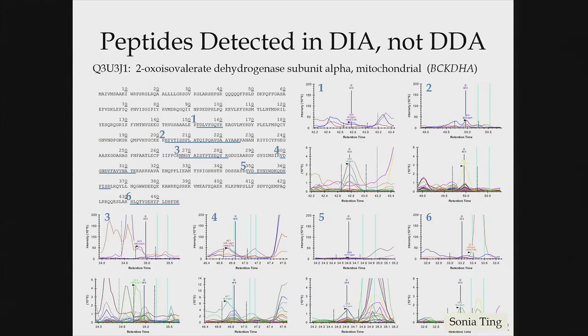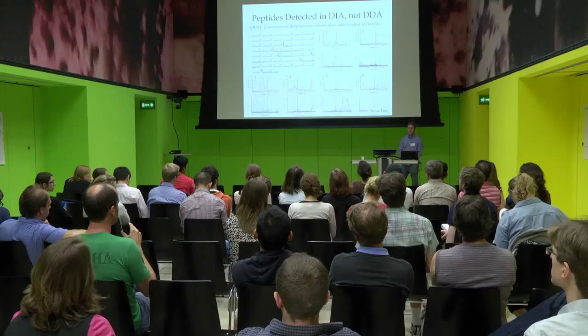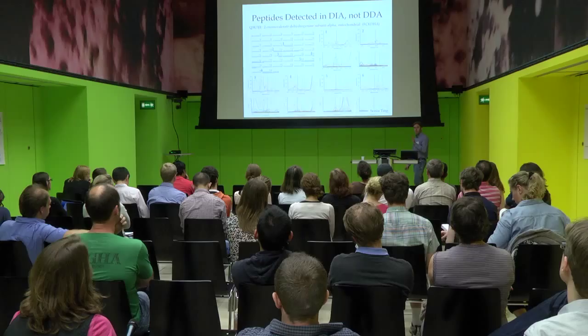These peptides are down in the noise, but keep in mind we're plotting many transitions — narrowing to the five cleanest would look cleaner. An important issue to keep in mind with DIA: for many modifications, you'll co-isolate a peptide and its modified form together in the same isolation window. For example, a peptide with oxidized methionine can co-elute and cause the MS2 signal to look very similar to the unmodified form. Without the MS1, it can be challenging to distinguish the two.